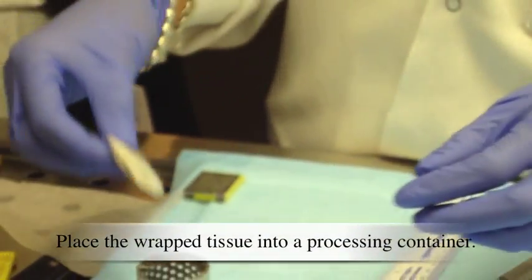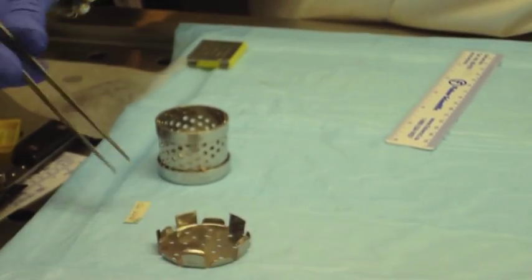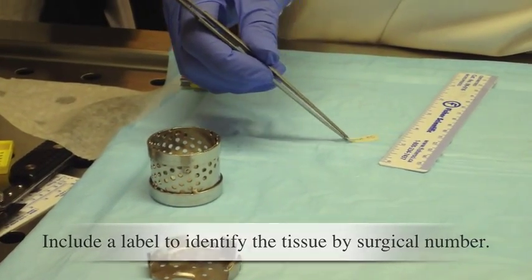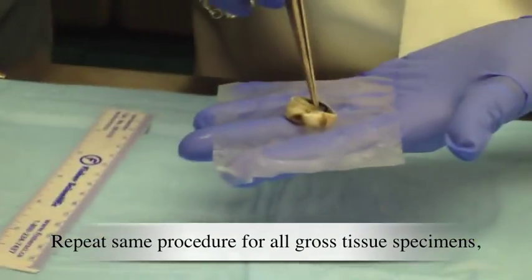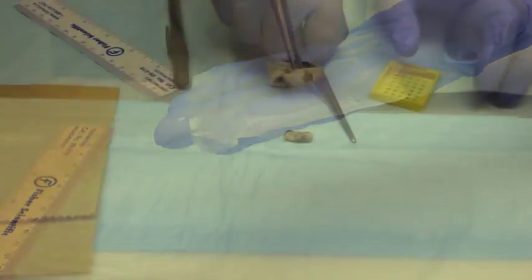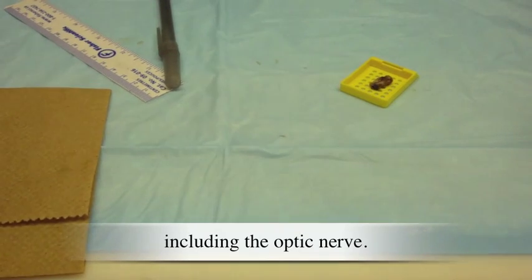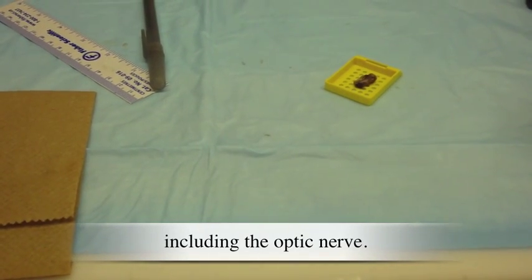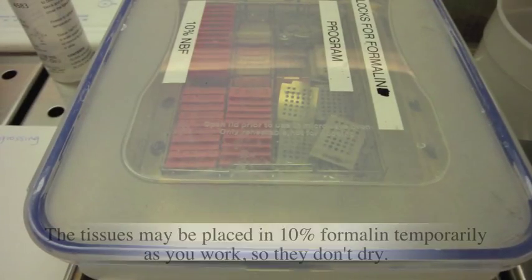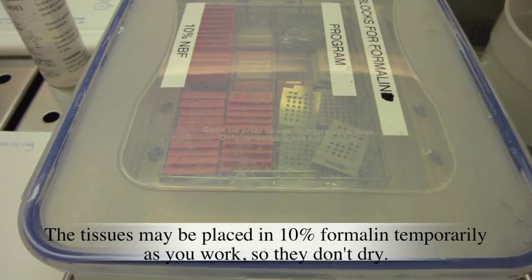Place the tissue into a processing container. Include a label to identify the tissue by surgical number. Repeat the same procedure for all gross tissue specimens, including the optic nerve. The tissues may be placed in 10% formalin temporarily as you work so they don't dry out.